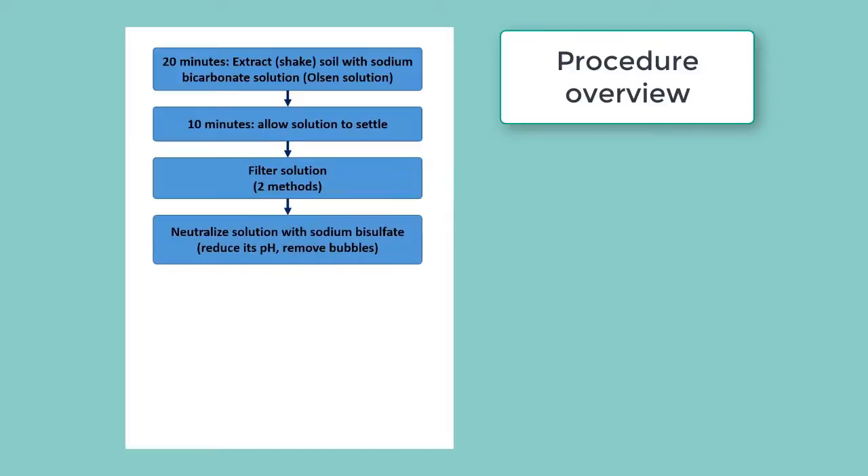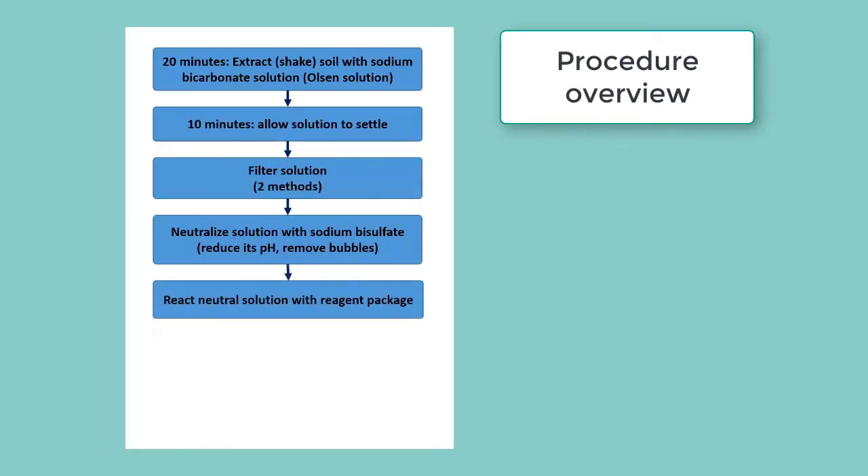Then we neutralize this filtered solution with sodium bisulfate, which reduces its pH and will cause all the bubbles from the bicarbonate to leave. Then we react that neutralized solution with a reagent package, which will create a blue color in the solution.